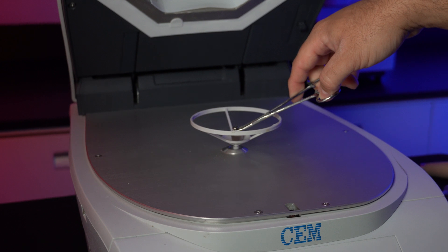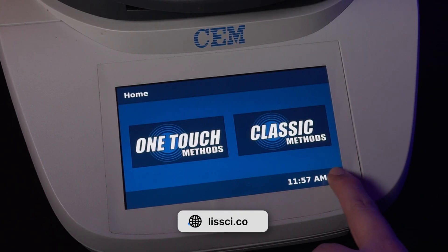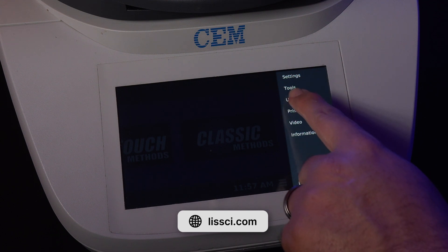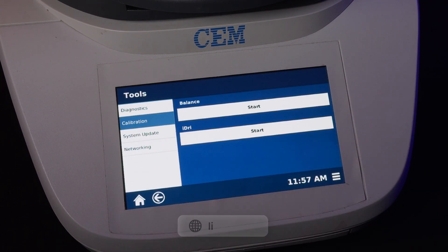For the balance calibration, a 10 gram weight will be required to complete the calibration. Press the system menu icon in the bottom right corner of the menu. Select Tools, then Calibration. Make sure there is nothing on the balance.